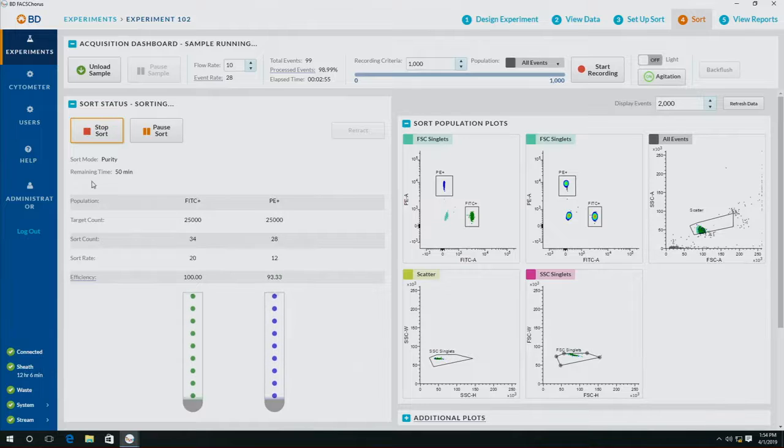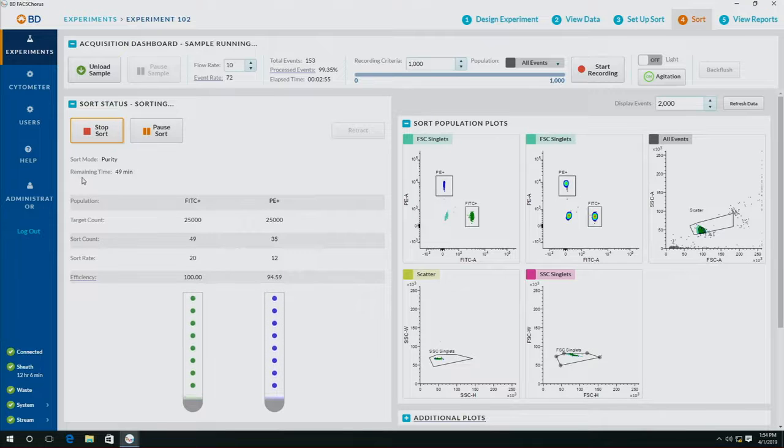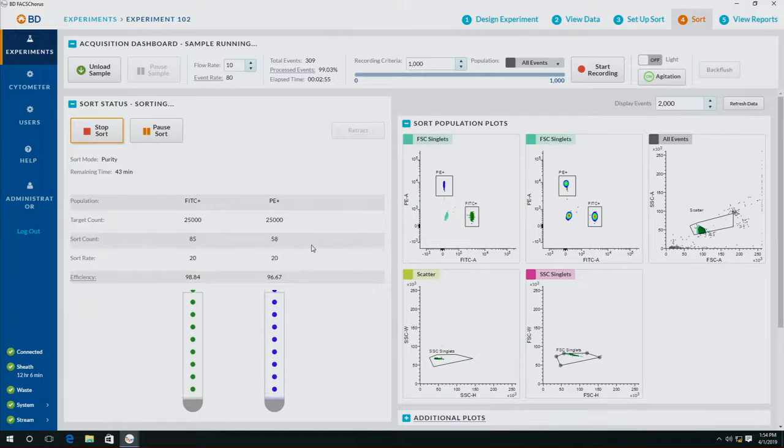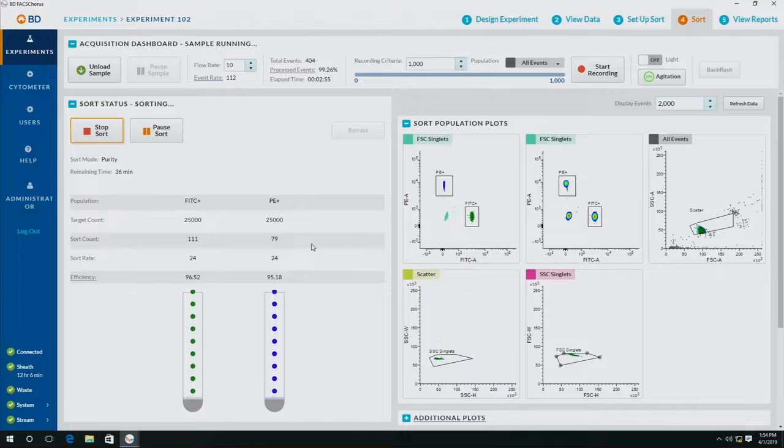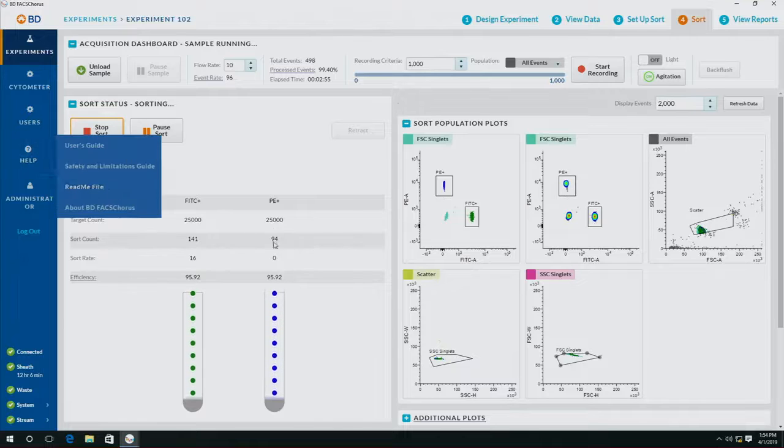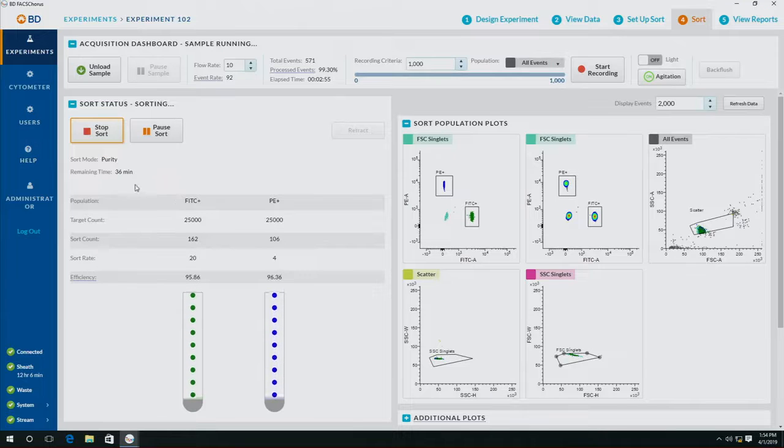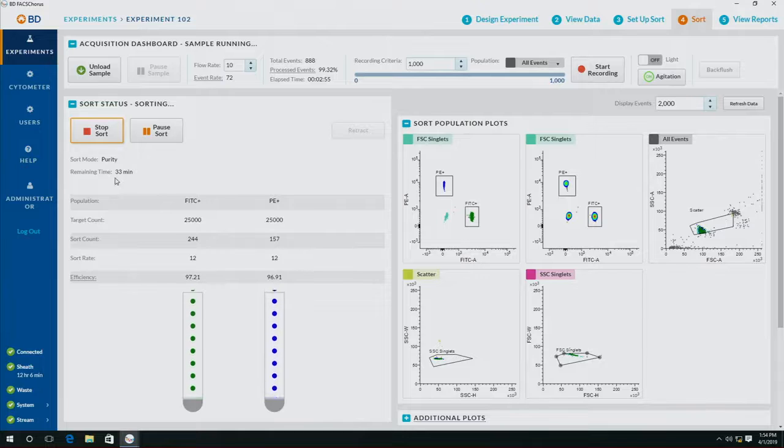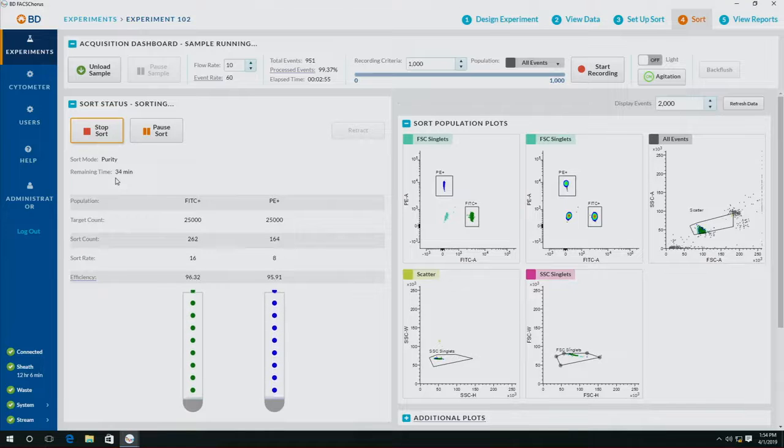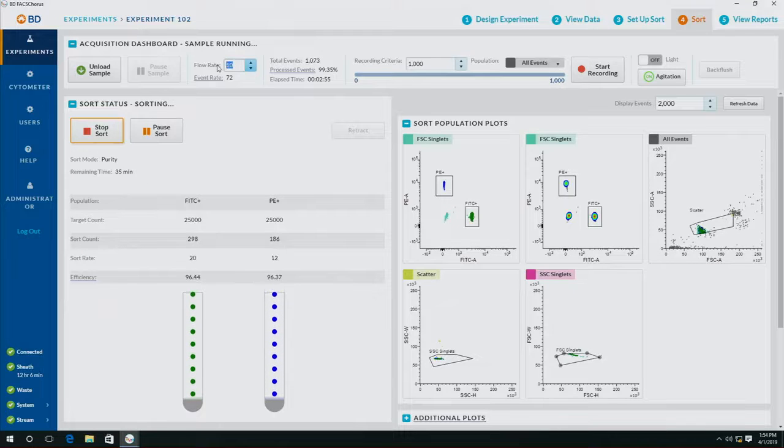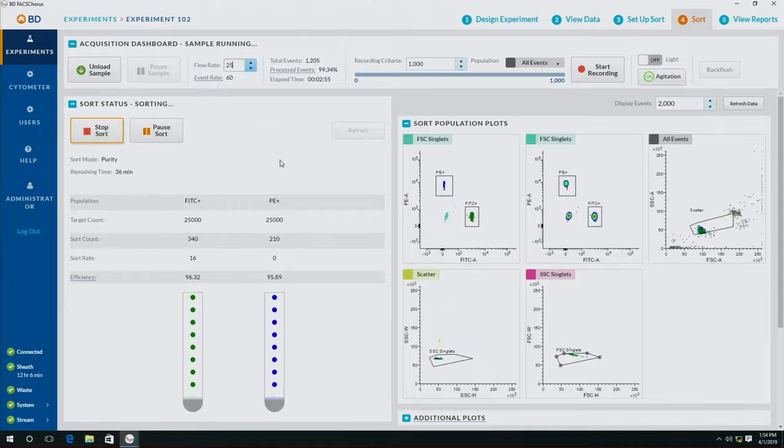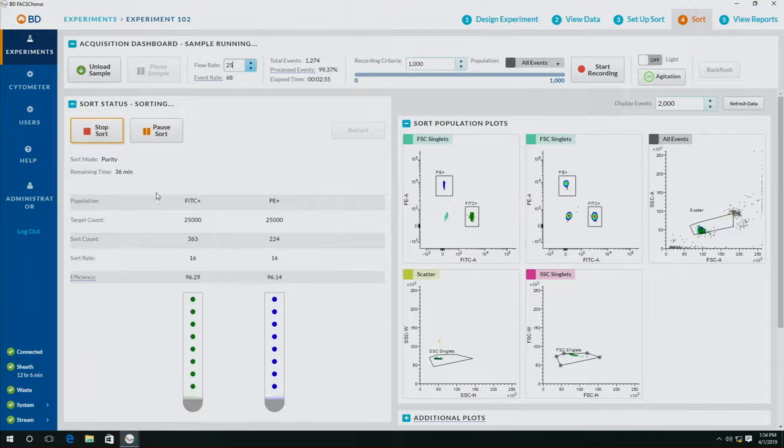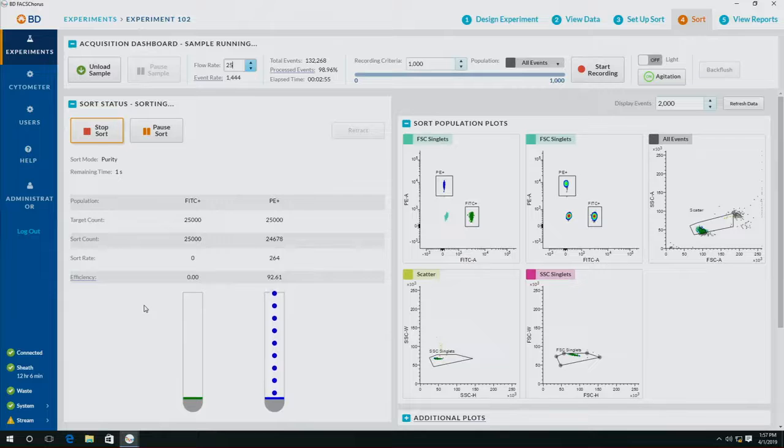Now that it is sorting, it is actually calculating at this flow rate and this cell bead concentration how much time it's going to take me to sort 25,000 beads. Right now it's going to take about 30 minutes. I can also go faster to make my sample go faster, and it's going to recalculate in real time how much time it's going to take to sort my cells.